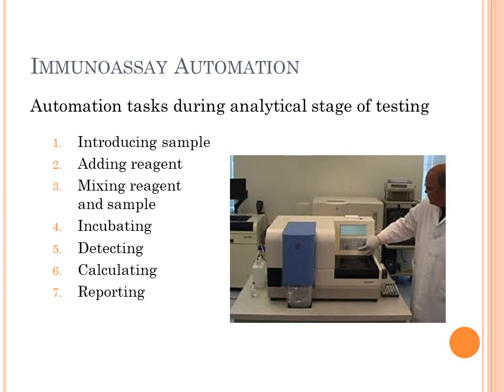The detector's built in, and then the data obtained from the detector goes to the computer. The computer makes all the calculations and spits out a printout and or captures the result to be electronically transferred back to the physician or the patient's chart.